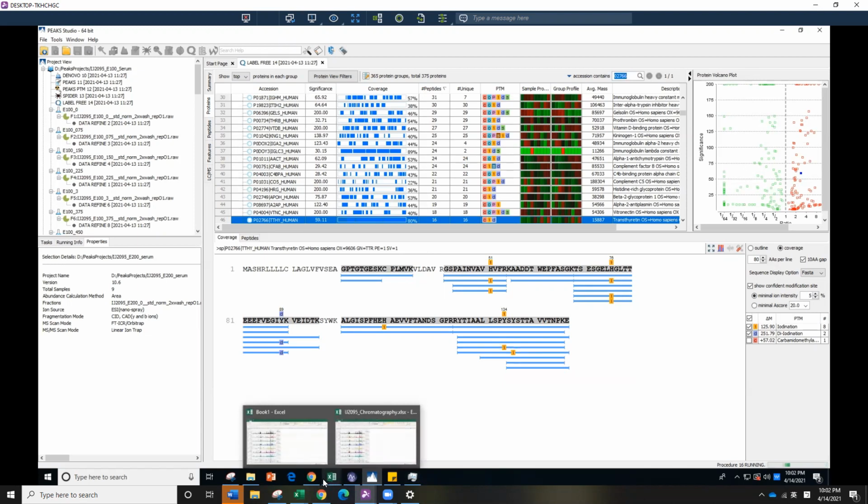So what we want to do, since we know the labeled peptide should be there already, whether or not MS selected it for MS2, is look at the MS1 data to see if we can quantify it differently if we already have something identified. So just saying this H51, that is what we want to look for.